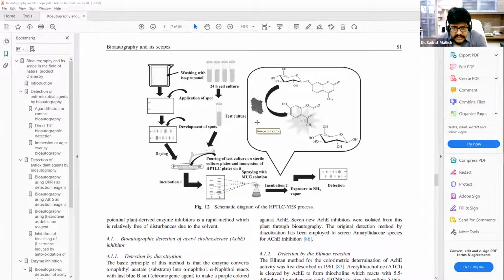Now, in certain cases, the fractions of the bacterial cells are also taken. They are not the bacterial cells directly being used for the study, but fractions, and here is an example of the same. So this is a very famous paper on estrogenic activity. What has been done is the bacteria is genetically modified to produce an enzyme which is responsible for Alzheimer's activity, and if it is deactivated, the Alzheimer's will not happen. That is the whole phenomenon.